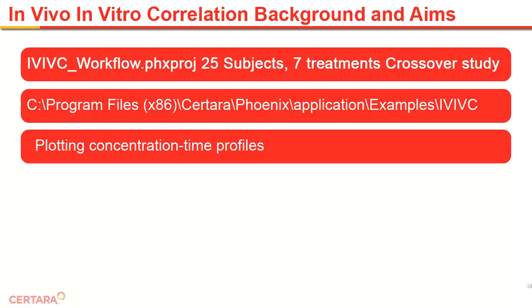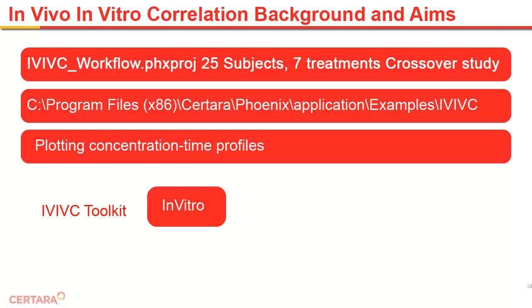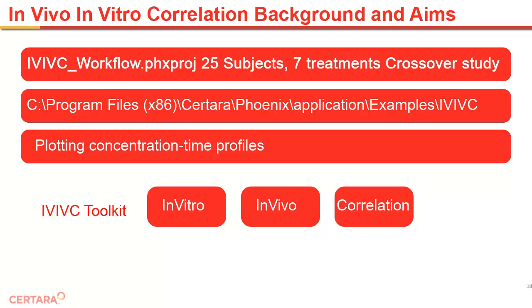We will first create graphs of concentration versus time to better understand the data, and then step through the IVIVC Toolkit's tabs of in vitro, in vivo, correlation and prediction.